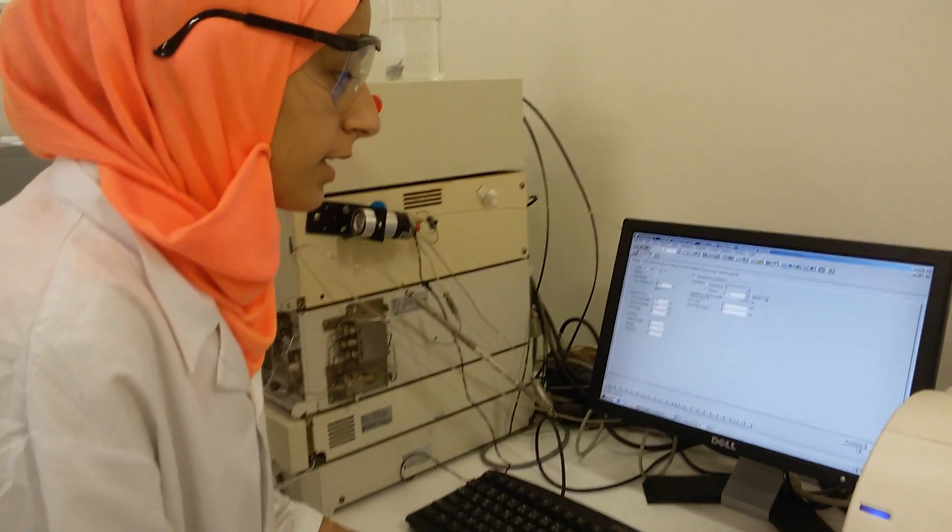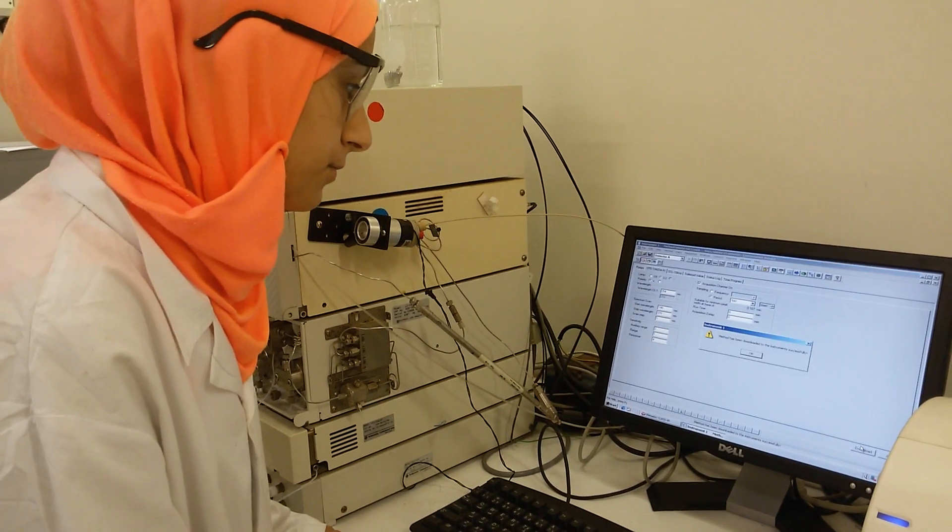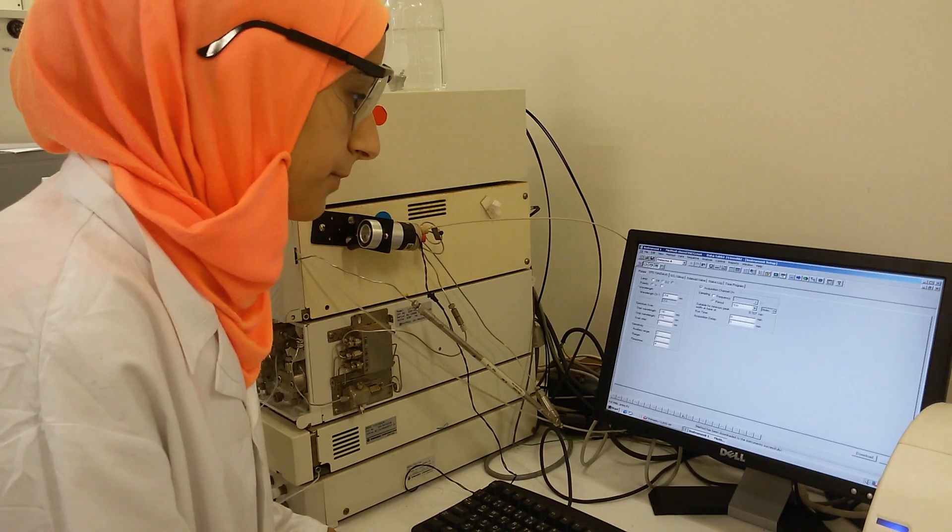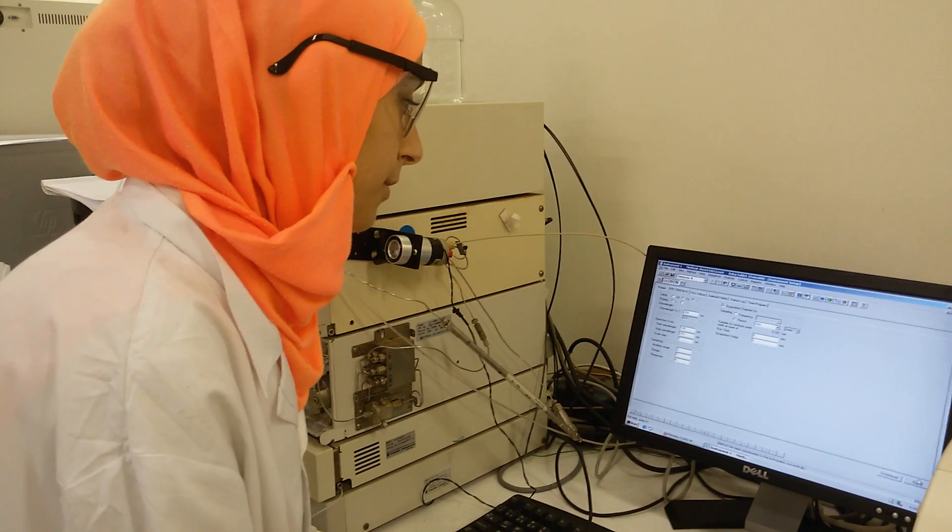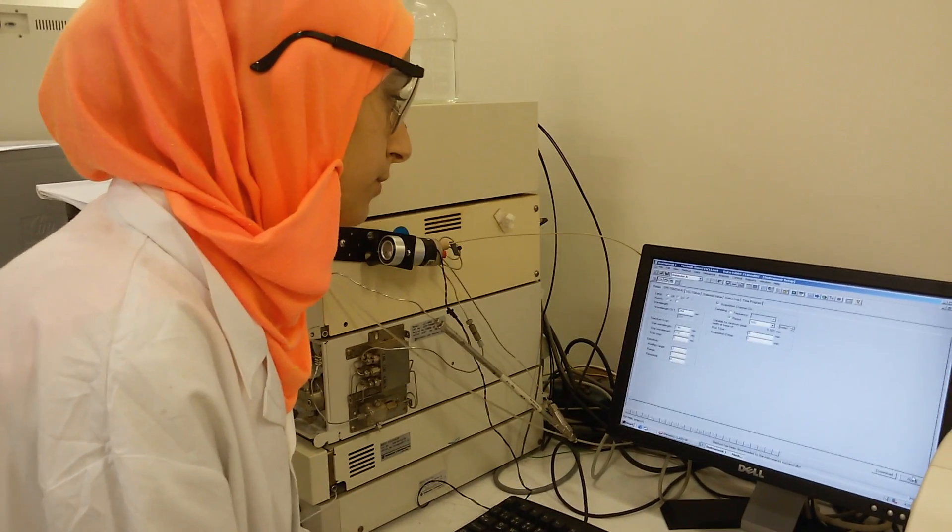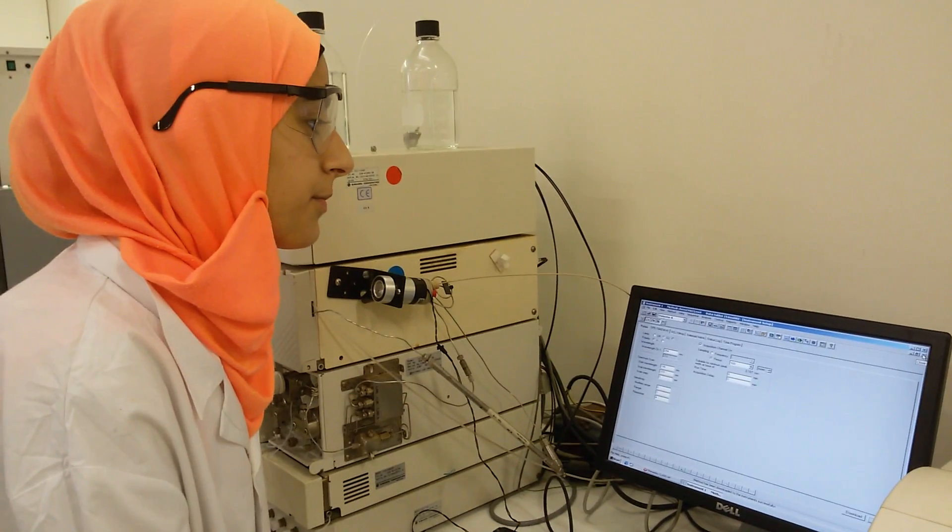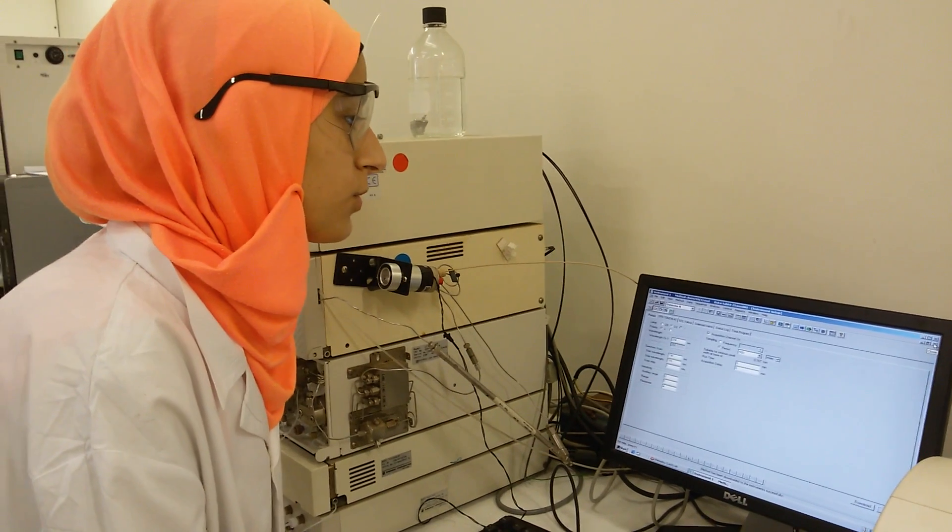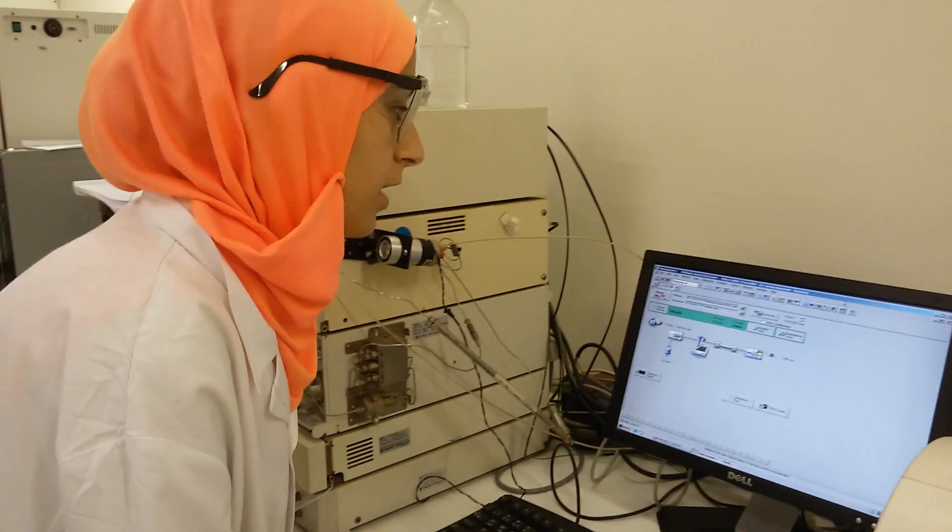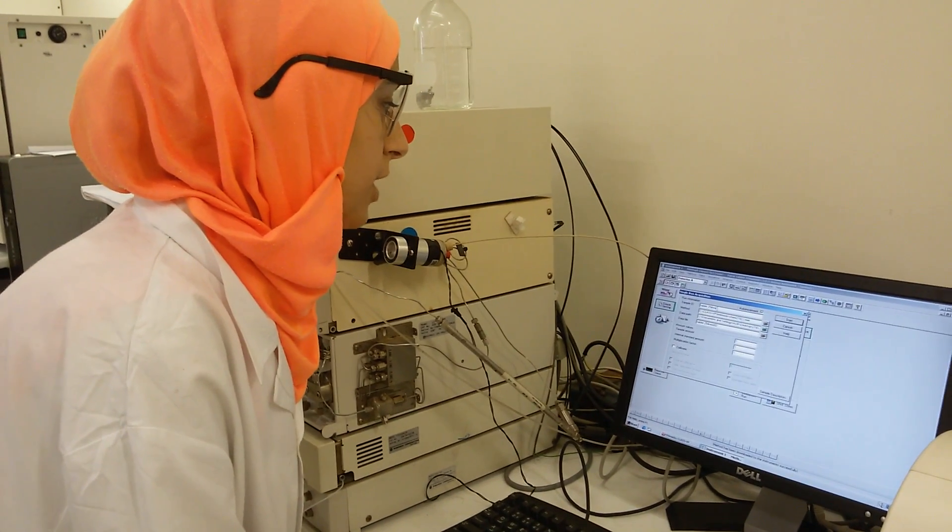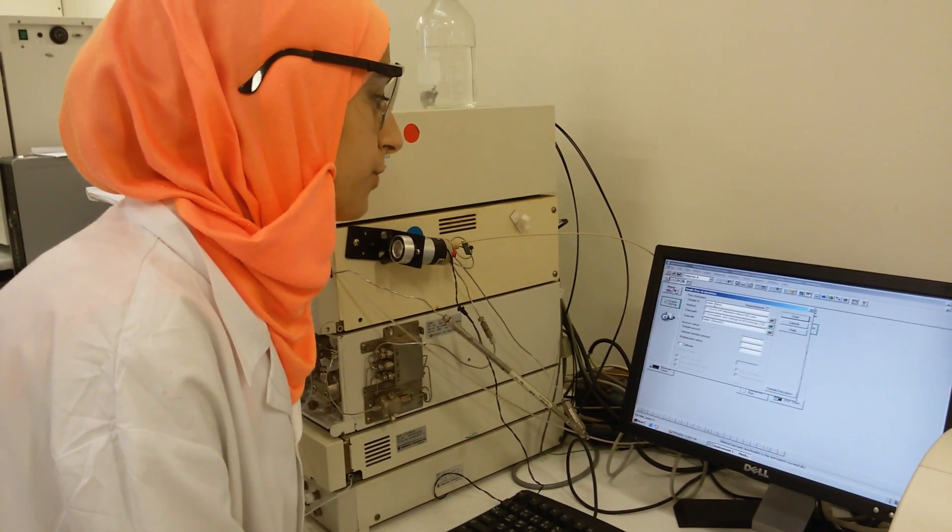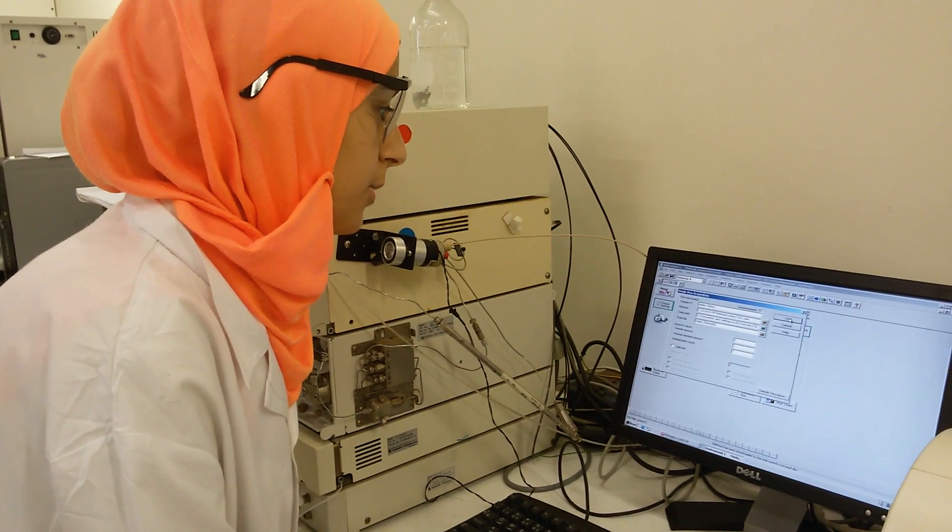Then, we click Download. Then, we close this window. We can click on this for the run. We should name our sample, which is Tablet 254nm, and press Start.